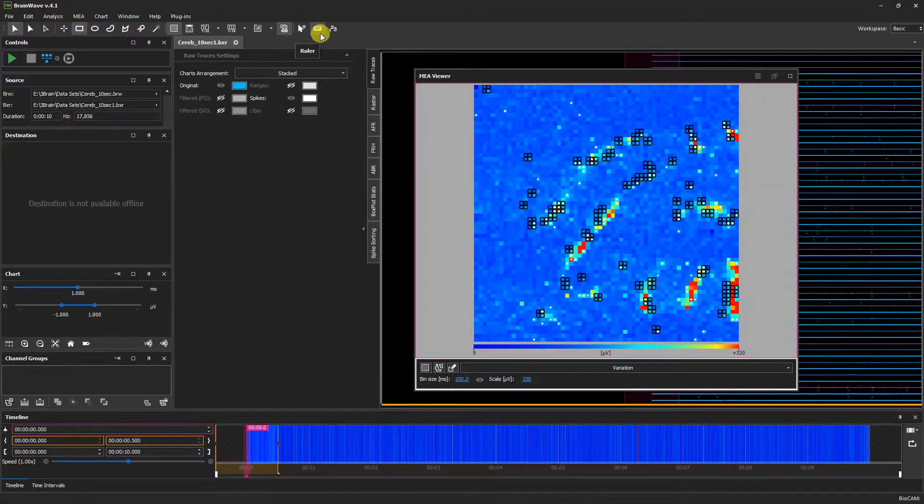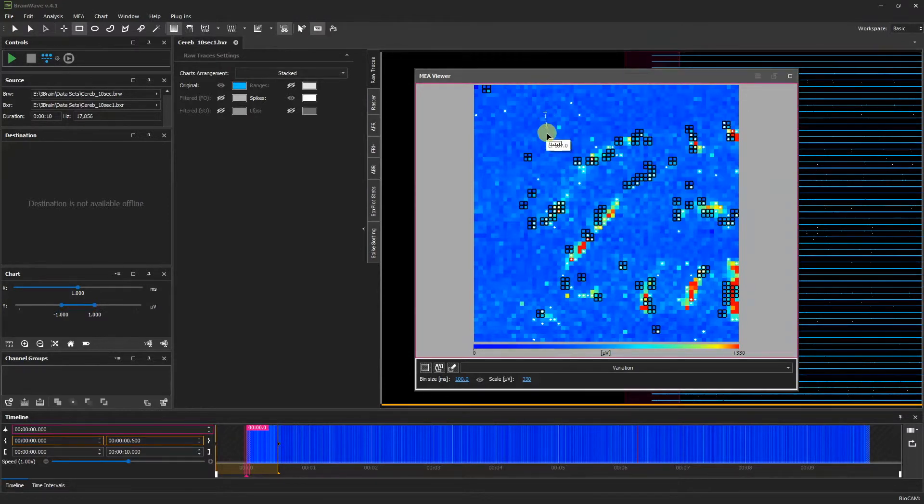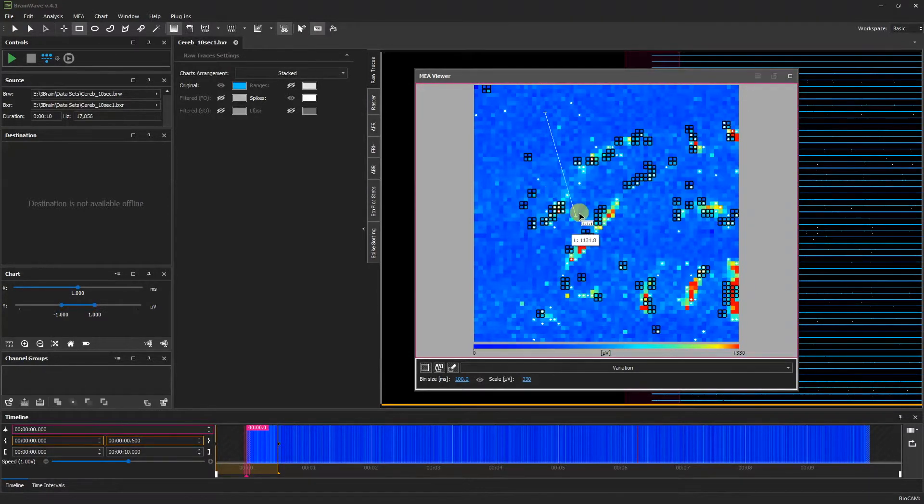We also have a ruler feature. By clicking it and then clicking and dragging anywhere in the MEA viewer, we can see the measured length.